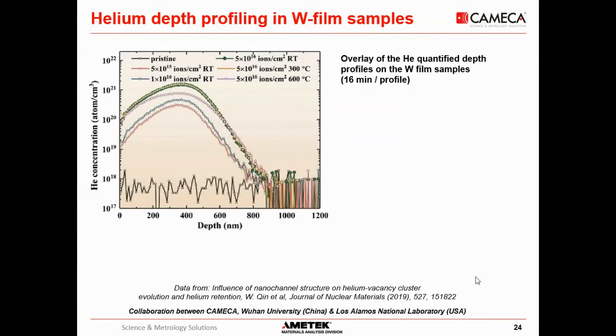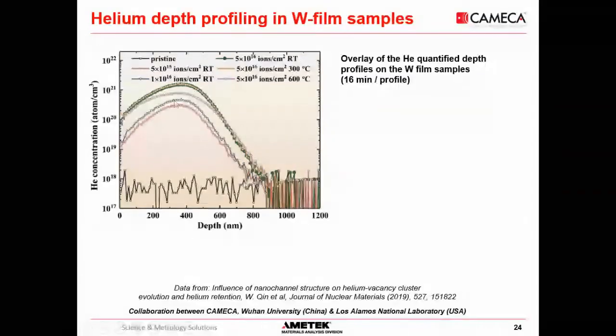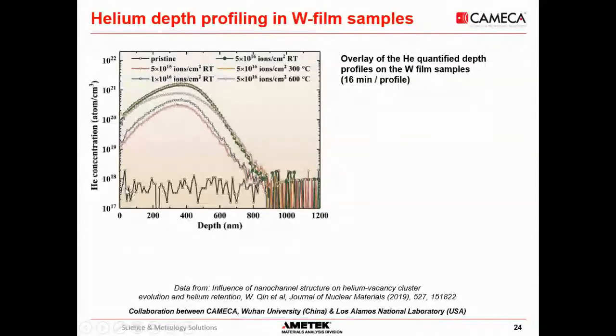We can see here the profiles. This data has also been published recently. And we can see the depth profiles in the different samples with different dose values. There was also a pristine sample with no ion implantation here. Each profile took about 16 minutes.